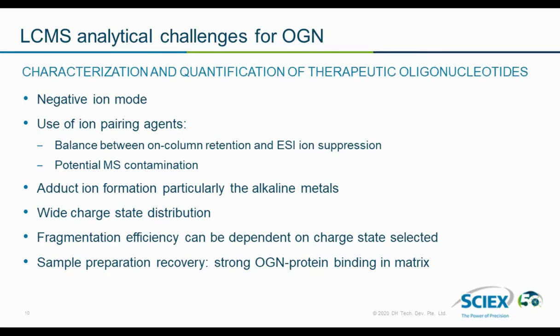The other thing you have to bear in mind is that these types of analytes quite easily form adducts, particularly with alkali metals such as sodium. So the presence of sodium salts can produce adduct formation, which will complicate the fragmentation of these molecules if you want to do MS/MS analysis. And typically you also have a wide charge state distribution as well, which can sometimes affect the sensitivity.